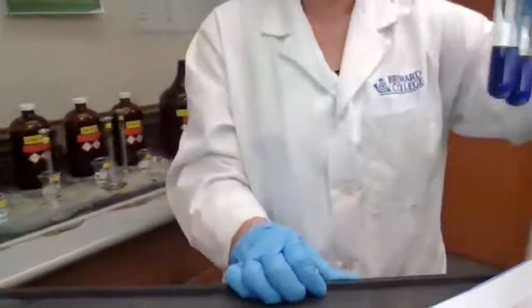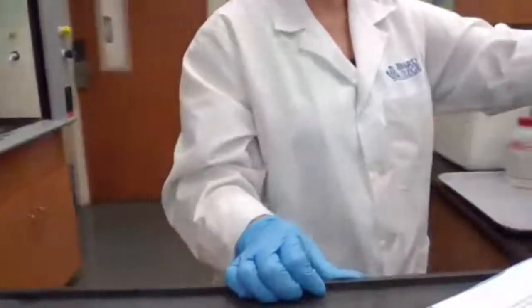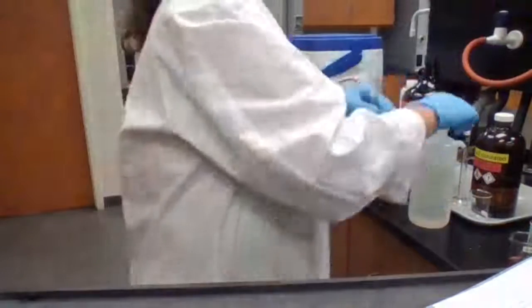I'm leaving one test tube in the test tube rack. To the other test tube, we are going to add deionized water.